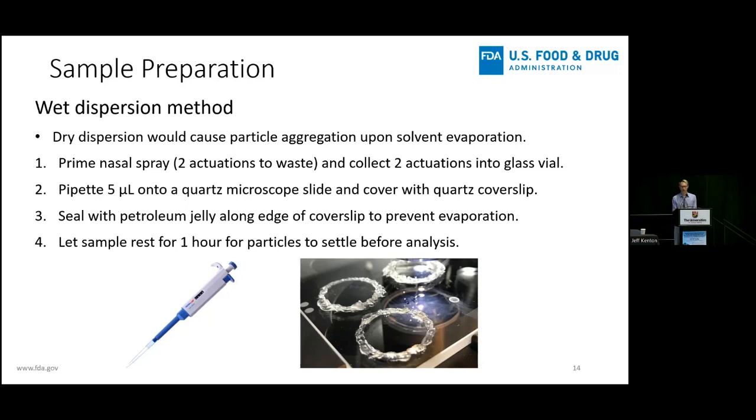A sample is allowed to rest for about an hour. This is formulation dependent. Really what you want to do here is look at your sample under a microscope. If you see Brownian motion, then let it sit longer. That is the ultimate goal. We do not want these particles moving around while we are analyzing the sample.